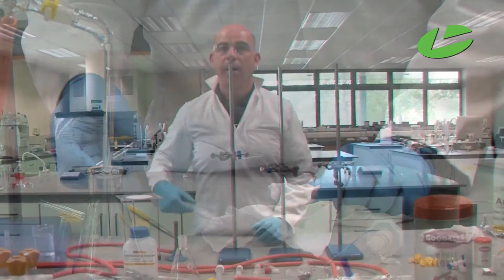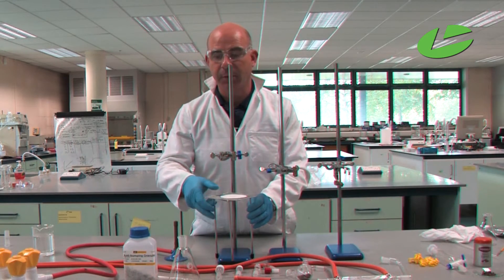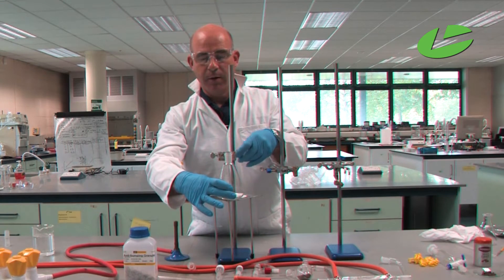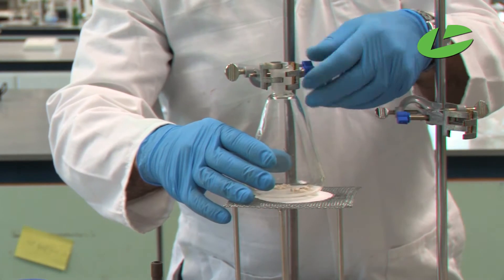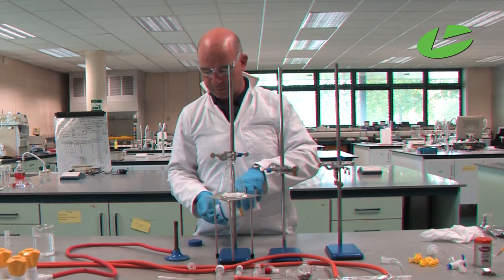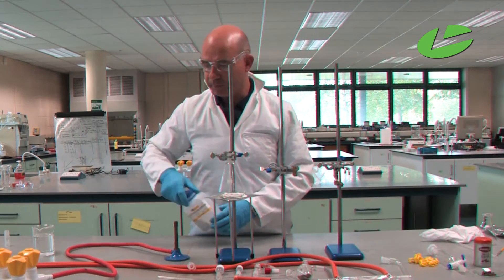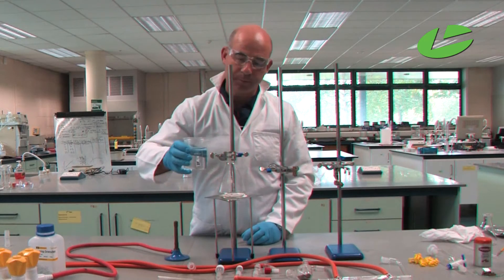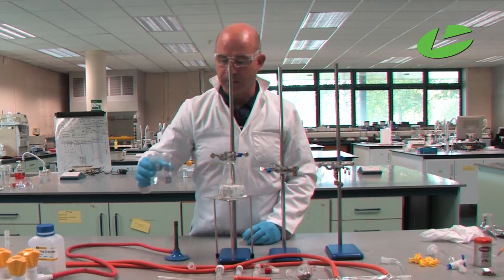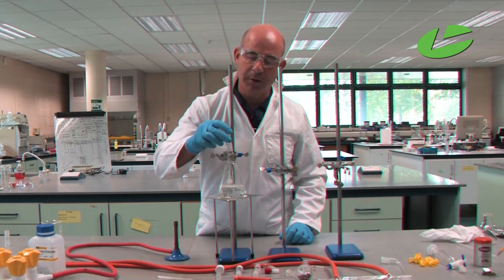To set up this practical, start off by moving your tripod underneath where you're going to clamp your steam generator. The steam generator is just a quick-fit conical flask — clamp that in place. Then add a small pinch of boiling chips, and then add in your water.